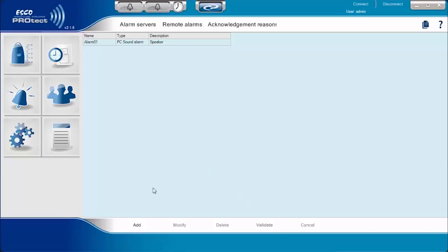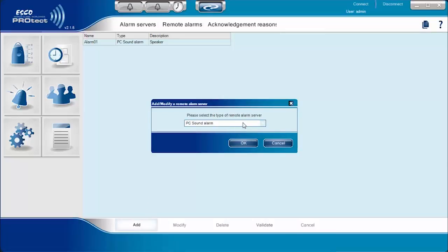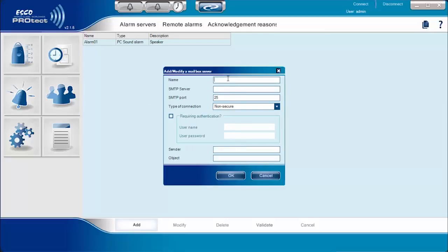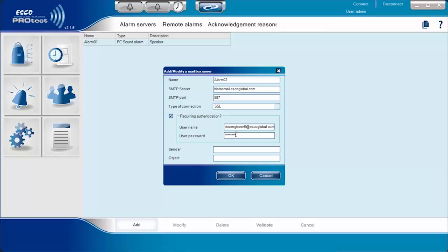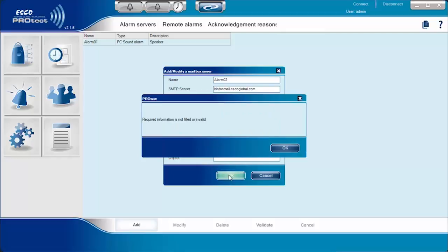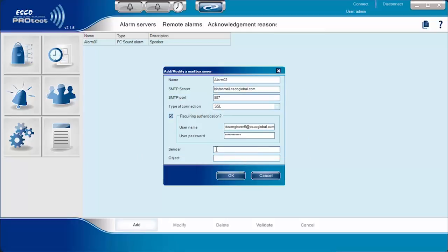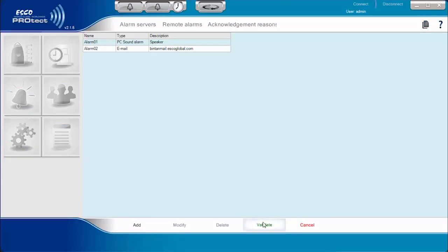Another example is setting up an email alarm system. The user needs to specify an alarm name, SMTP server, and SMTP port based on the company's internet settings, type of connection, username or email address, and password. Please make sure that all fields are completely filled up, otherwise the system will not continue. Again, always click Validate.